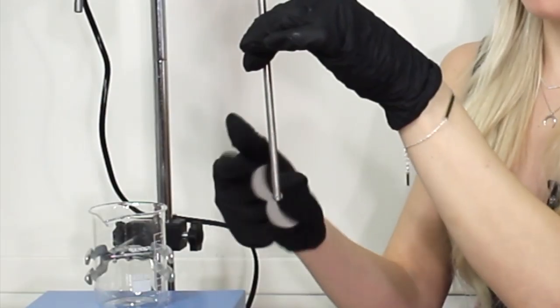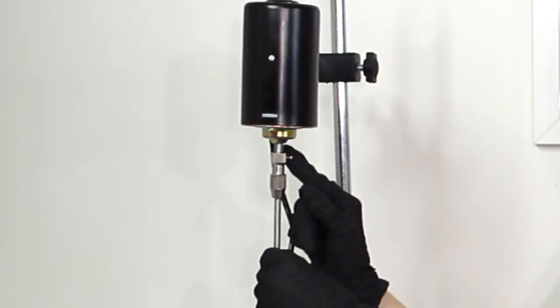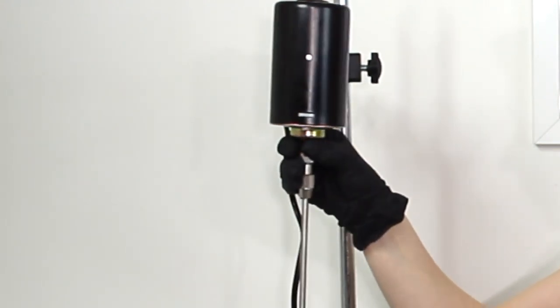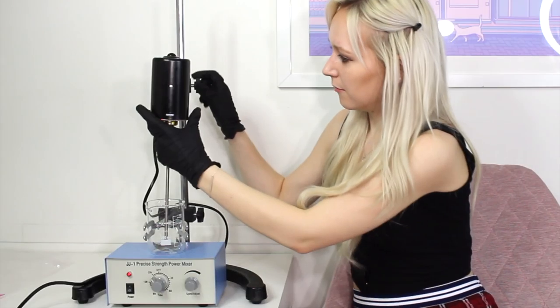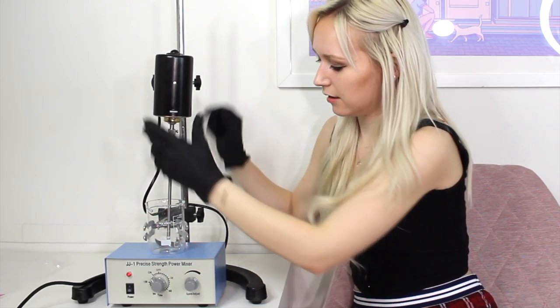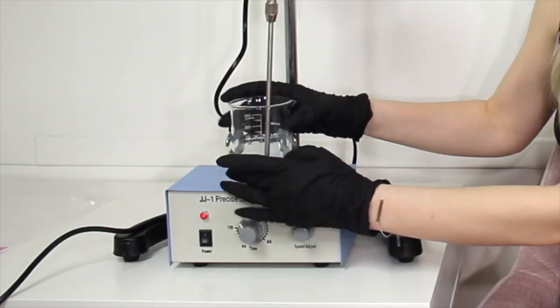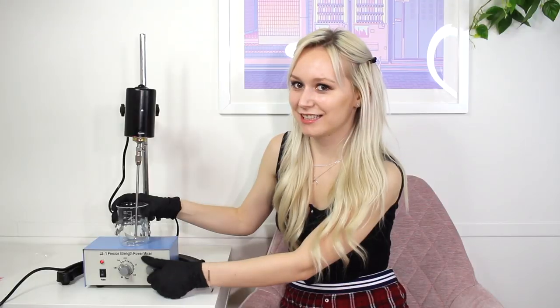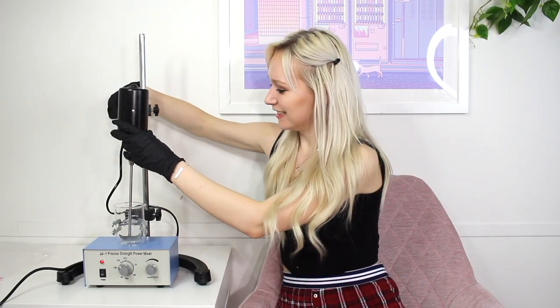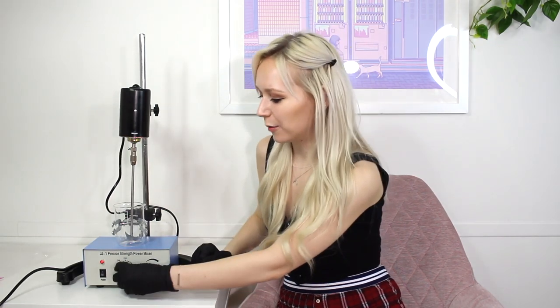Here is the mixer. It has this little wobbly sharp thing on the end. All you do is push it in and then screw it in — you want to make sure you screw it in with a screwdriver to make sure it's nice and tight. Lower it down so it's just floating a tad above the base so it doesn't scratch up the beaker. Now all you've got to do is turn it on. If you turn it up too high it'll start to shake and it started scraping the edges of the glass beaker, so it definitely works better when the beaker isn't balancing on a surface. It is literally that easy to use.